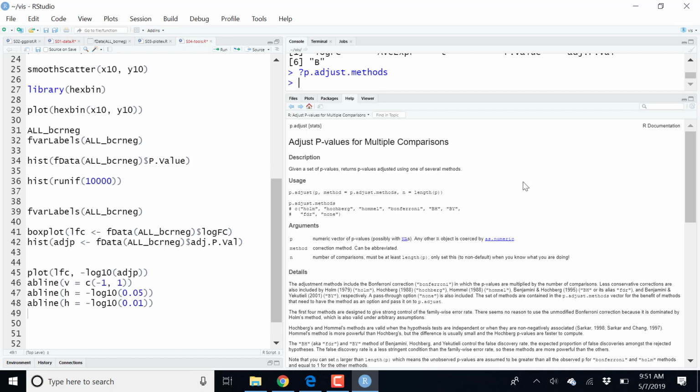I guess Benjamini-Hochberg, the default in many methods, is fine. That is, I think, not what's going to make or break your analysis. You need to do an adjustment, and I don't know, Kai, if you have a different experience, but I think they should all be very equivalent.